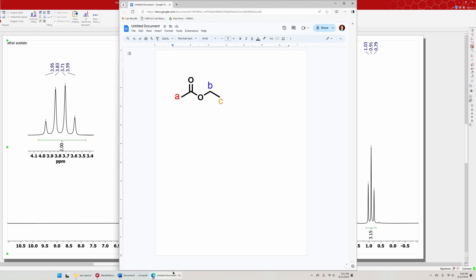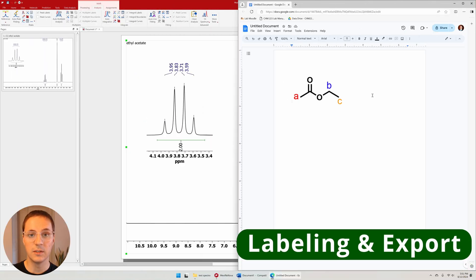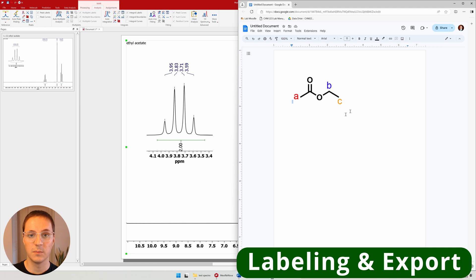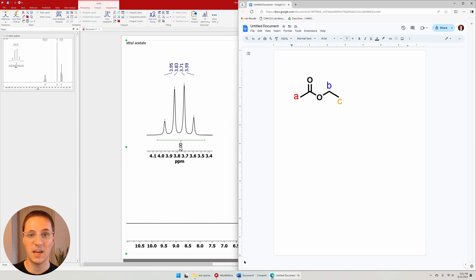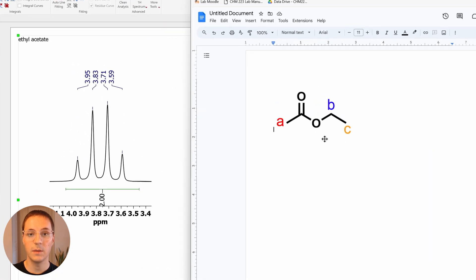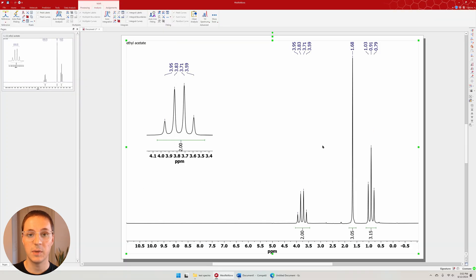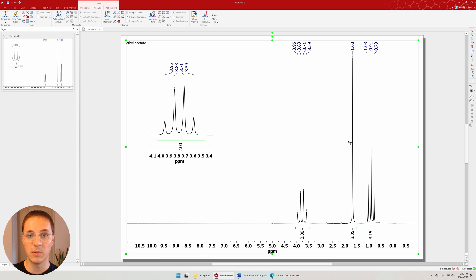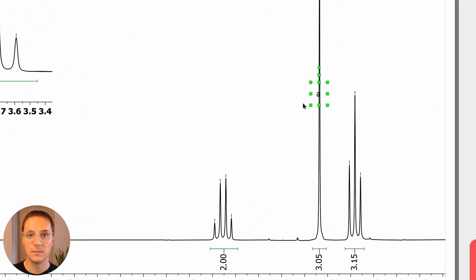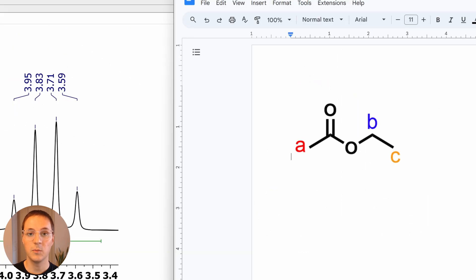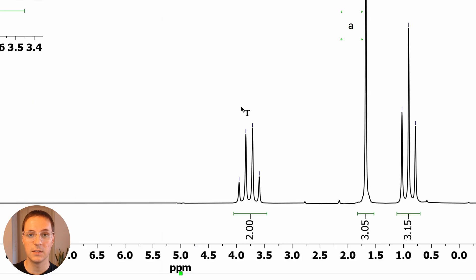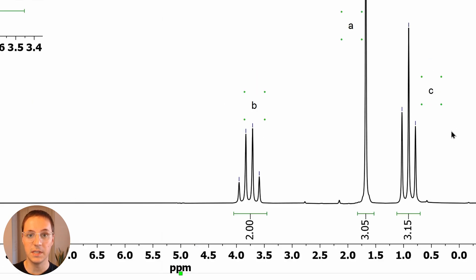I want to label the signals on my spectrum to match the assignments of this structure. Here I've labeled the isolated methyl group as signal A. On the spectrum, it's clear that the singlet corresponds to signal A. I'll use the text tool by pressing T to add a label. Signal B is next to an oxygen, so it has shifted downfield. That makes this signal C.